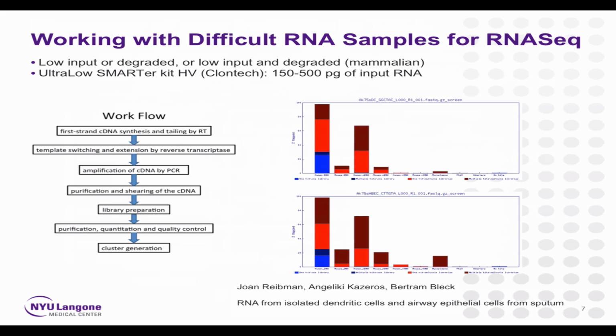Now, it's not always possible to obtain RNA in very beautiful shape and form or high quantities. So those are what we call the difficult RNA samples. We can work with all kinds of RNA samples.